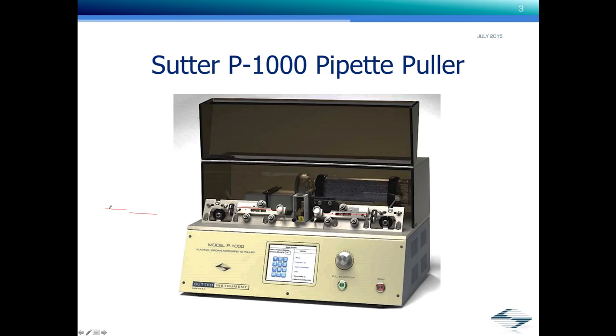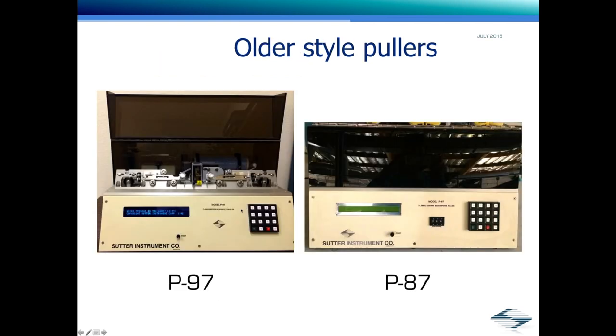And so I don't know if it's really necessarily bending, it might be kind of off center to the shaft of the glass. It might be eccentric rather than bending. If it's actually bending, you might have some issue here in the clamps where the rubber padding's lapping over, or the rubber padding's missing, or you have a little burr in the metal. What you should do is probably send some images of the glass, how it's installed in the puller bars.